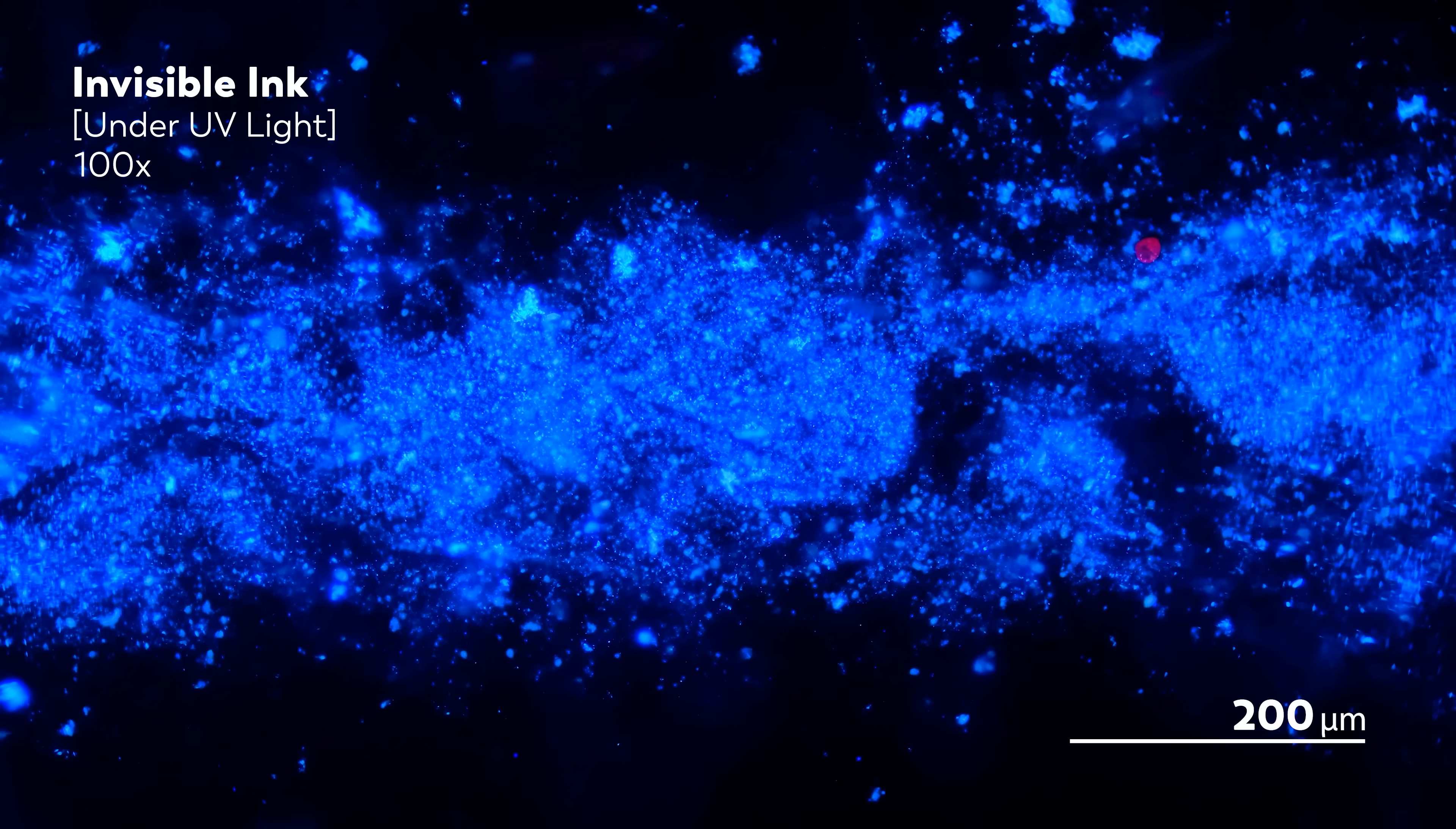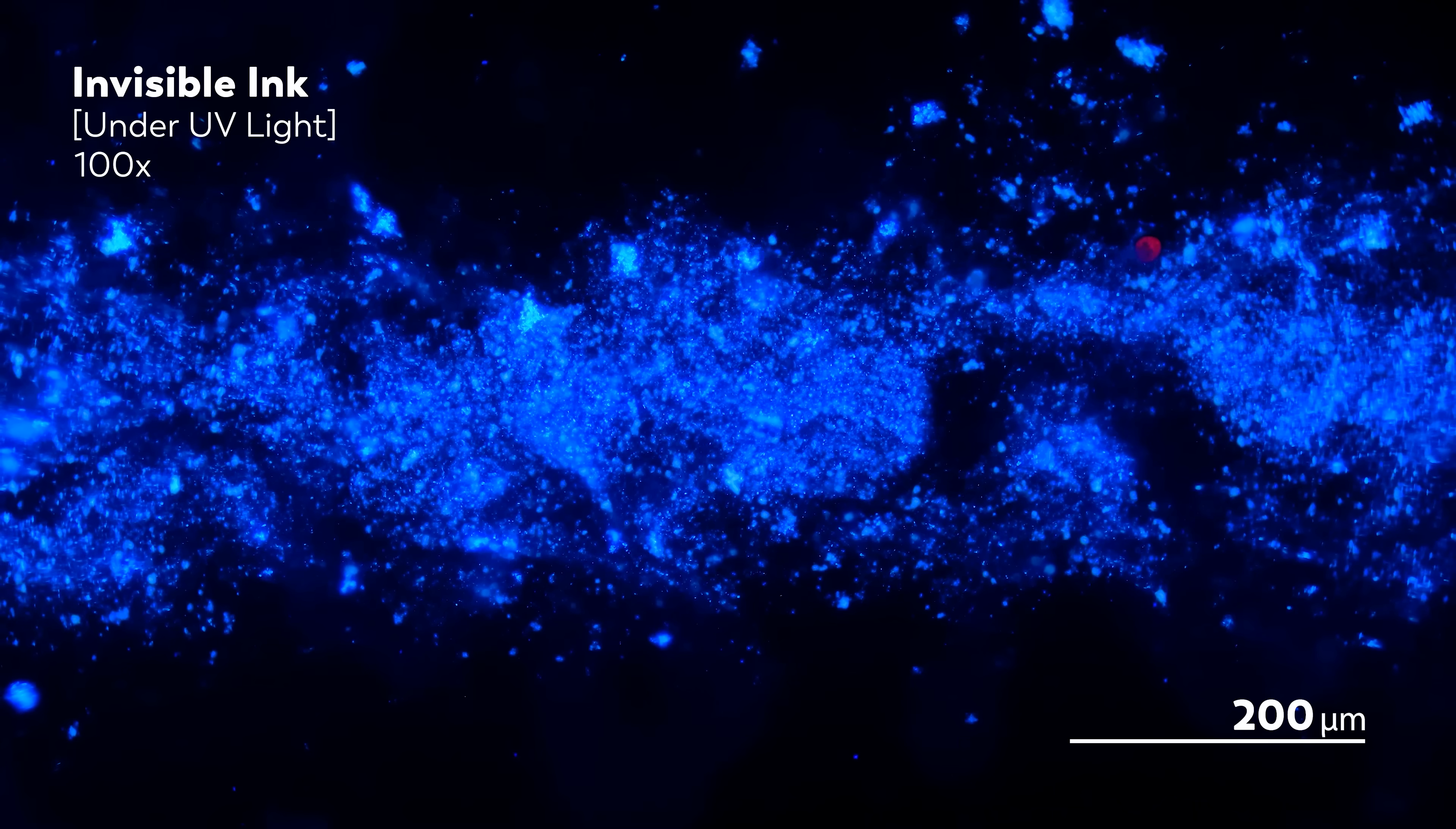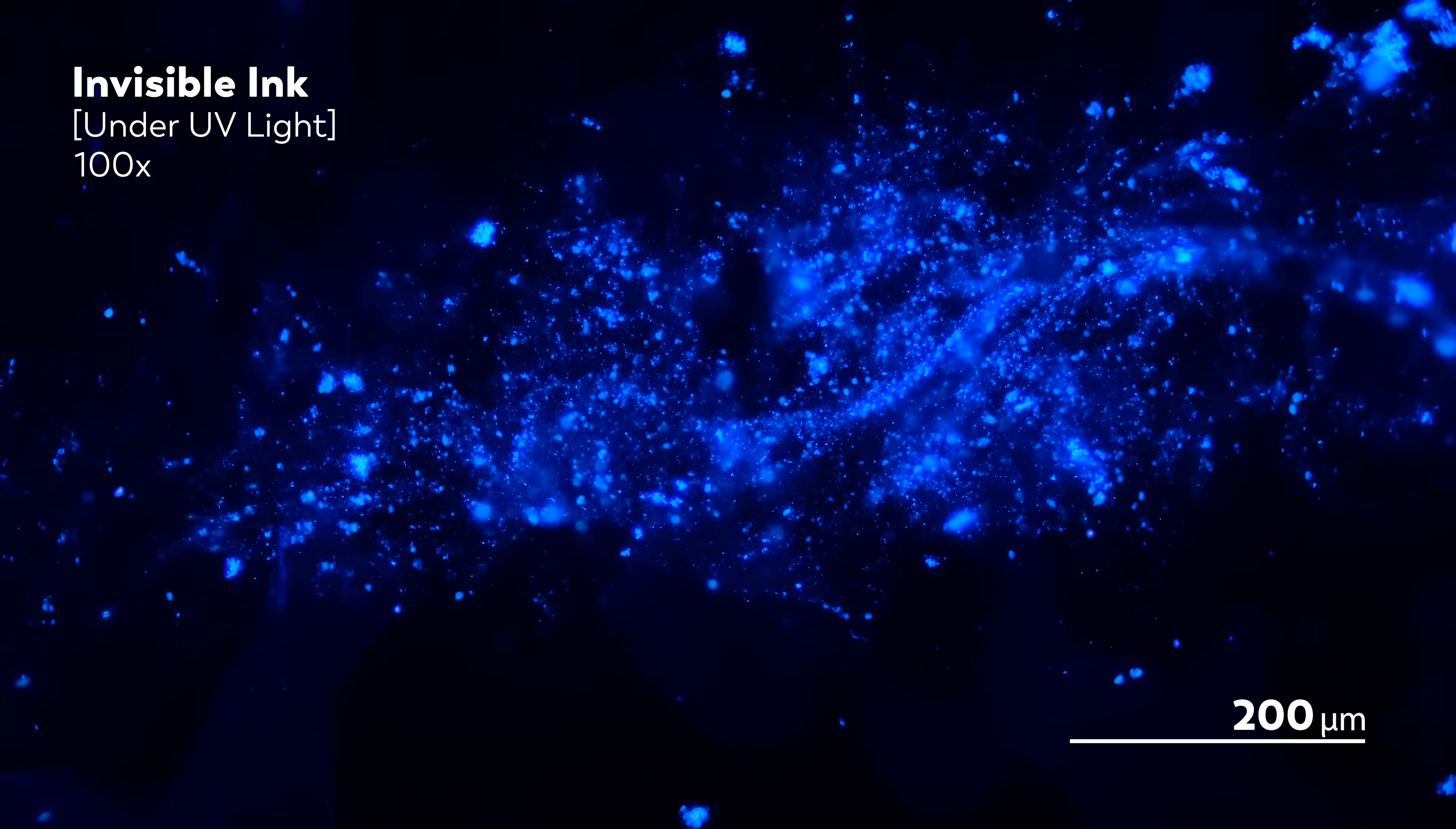The shining blue parts are the ink. And you can see the way they create these beautiful, galaxy-like structures that other organisms swim through. Some of the experiments that James does, like this one with the invisible ink, are about making beautiful things that might help him study the microcosmos in new ways in the future.